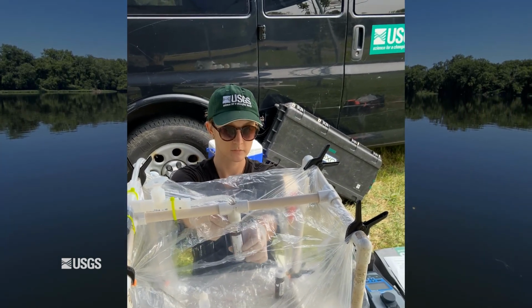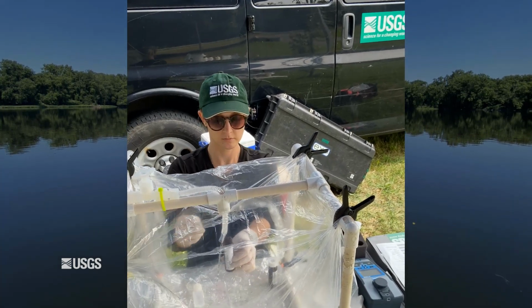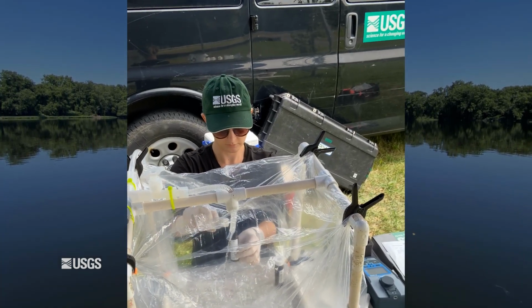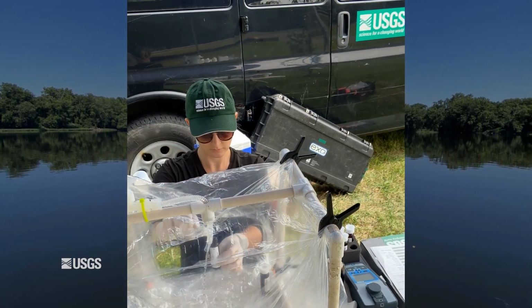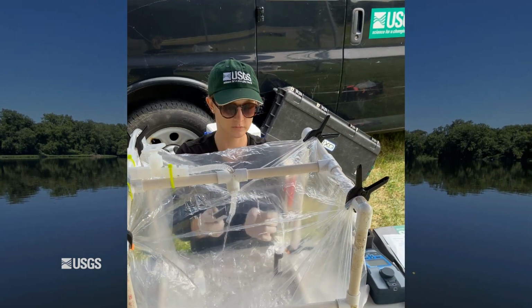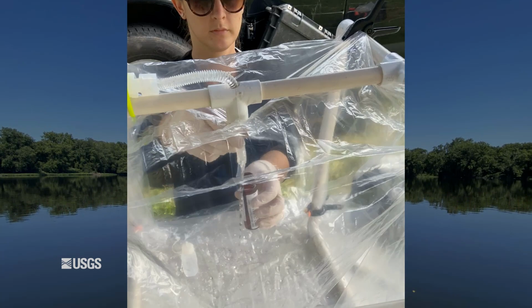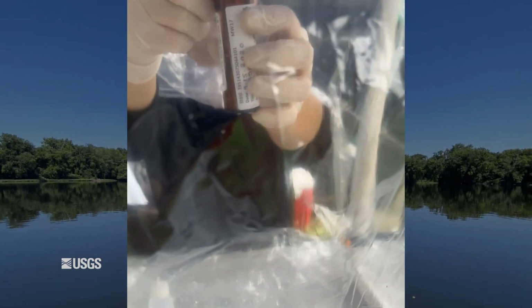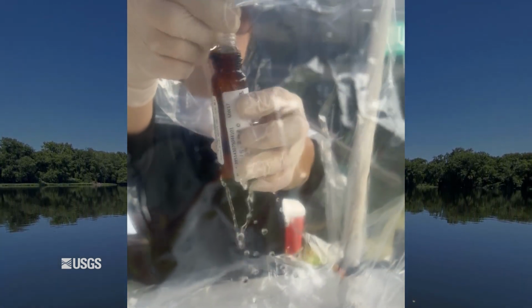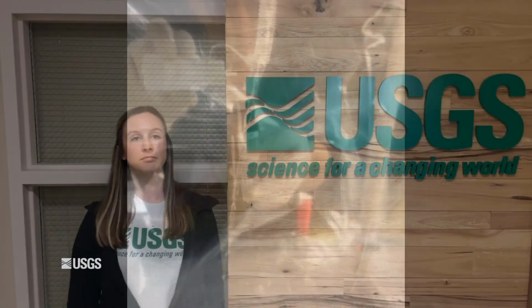The well water is pumped through tubing, a manifold, and into our sampling chamber, where each of the vials is filled with sample water. A few drops of hydrochloric acid are added as preservative for the sample. These vials will get analyzed for volatile organic compounds, so after the sampling is complete, they'll get packed on ice and shipped to our National Water Quality Lab in Denver, Colorado. This lab performs most of our water quality analyses.